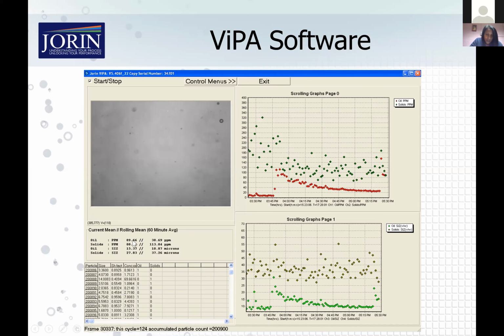So you can see here, for example, that you get sudden highs, but averaging over a period of time, it's actually lower. In some instances, that's the sort of thing that customers need to know about when they're running their systems, as to whether you're just going to get a one-off high value, or whether it's actually an alarm condition that you want to raise.